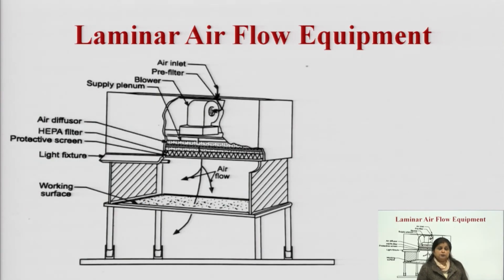So after that comes the laminar airflow units. We have to also discuss this, what we call laminar airflow. Laminar airflow is actually a unidirectional flow. Why do we need unidirectional movement or flow? So that we are able to remove microorganisms and dust particles from our area. This is a special type of unit which is placed within grade A.